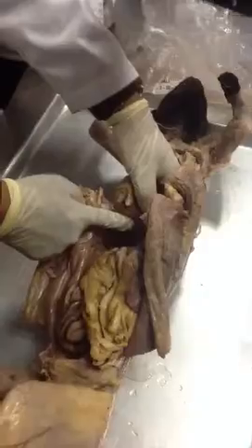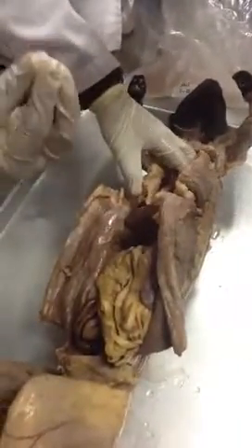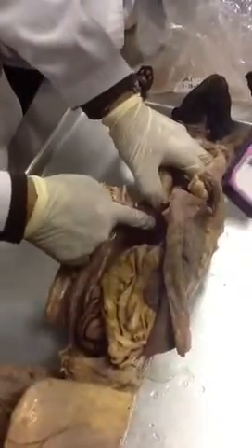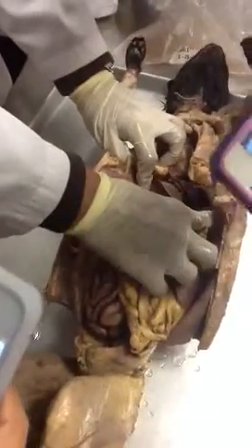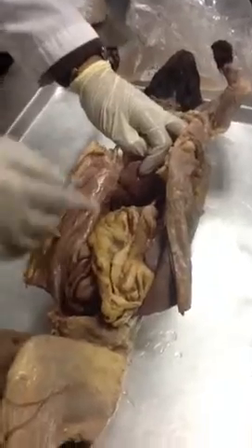So this is the gallbladder, all right. Normally it appears green and like a small sac. You can see it here, but it is kind of buried within the liver structure. So this is the gallbladder right here. Don't worry. Everybody's here, right? Okay.